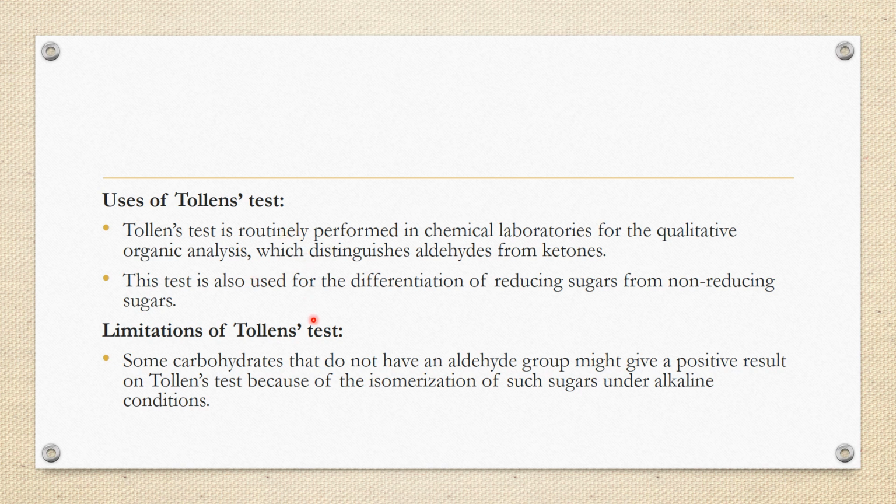This test is also used for the differentiation of reducing sugars from non-reducing sugars, because if the result is negative, that means the sample doesn't have reducing sugars.